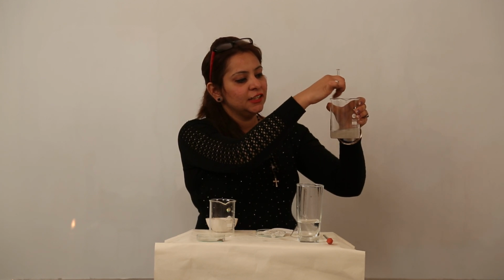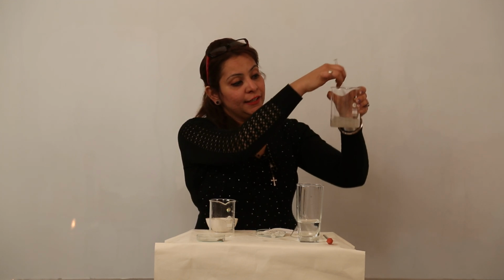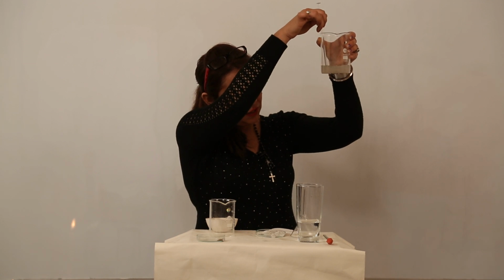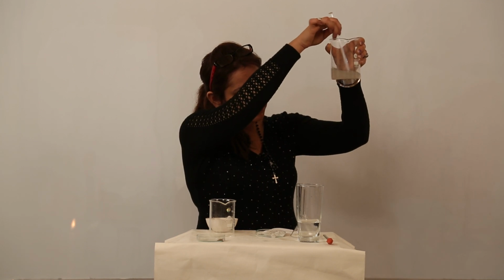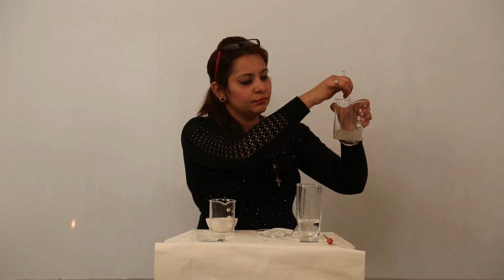What you get to see is the salt particles dissolving in water, because we know salt is soluble in water. Out of the two components, one is soluble, that means the salt is getting dissolved, but the sand is not getting dissolved. You can see it is accumulated at the bottom, but still many particles are suspended in the water as well.